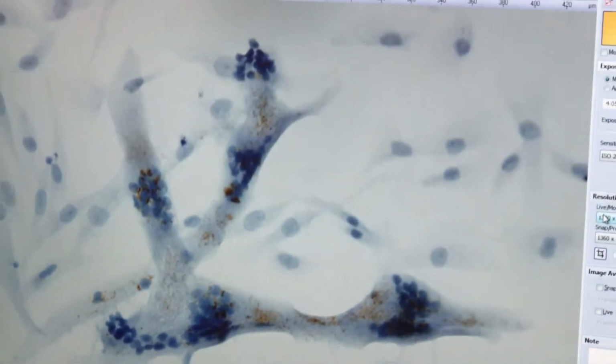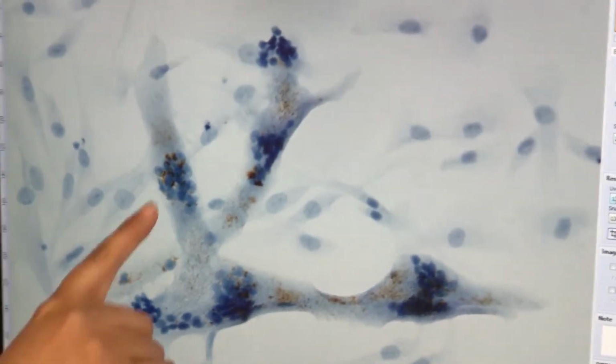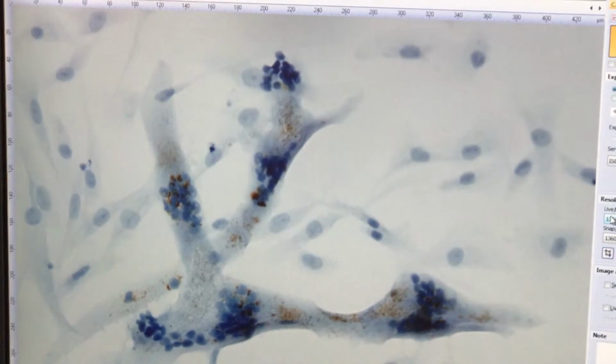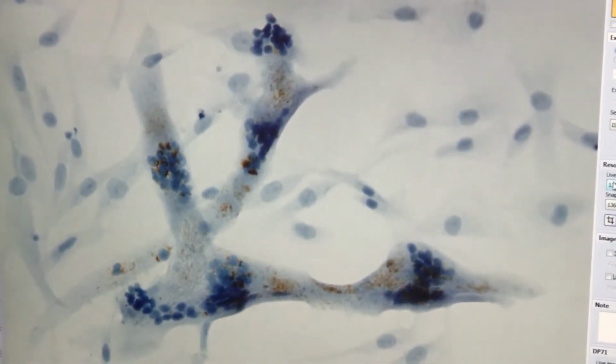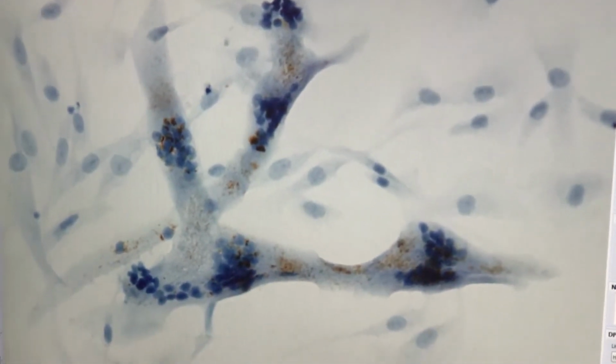At the 7th day of differentiation, you see that fibers start dying. The form of the tubes changed from the previous one that you saw. And you can see more DUX4 in the tubes. And the amount of DUX4 increased. The blue ones are nuclei, I see, and the brown is DUX4 messenger RNA.